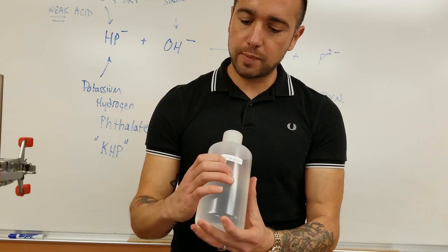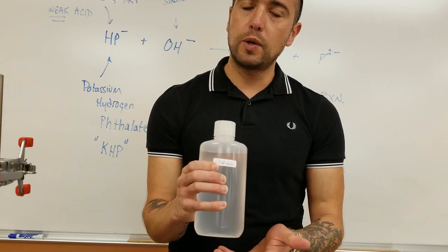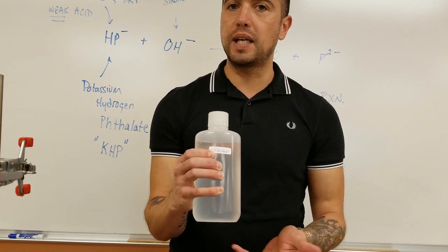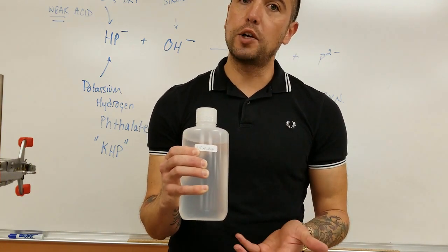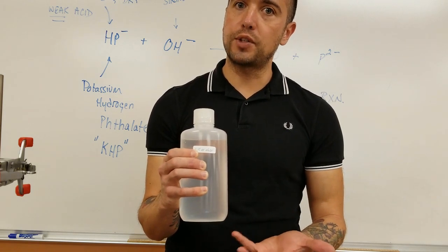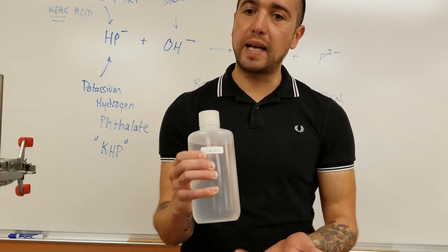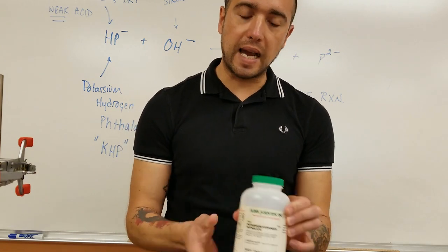We know approximately what the concentration was. We measured it with a volumetric flask. We really were only able to get two significant figures though because of how it was created. We'd like to know with more precision what it is, and so we're going to react it with a powdered acid.